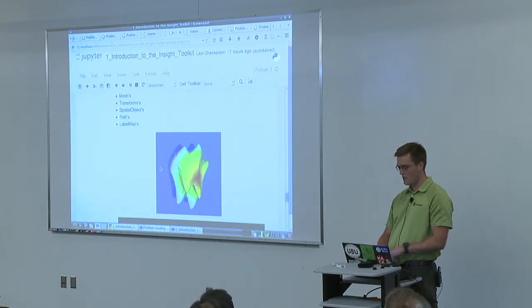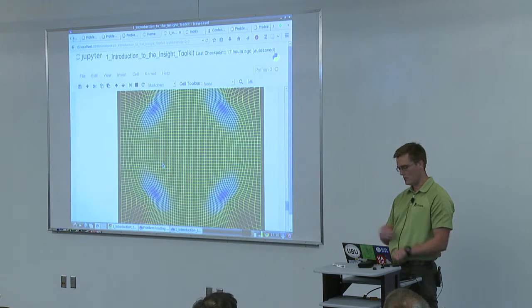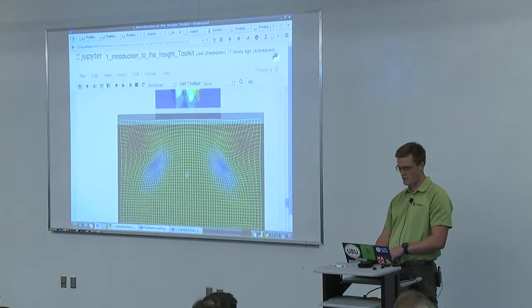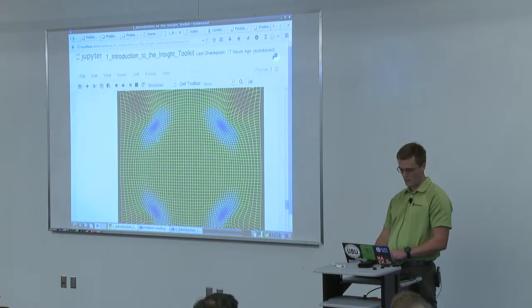But it's also extended, it has support for other things other than images too, like meshes, transformations, paths. So people who are doing analysis of dendrites from neural cells. And here's an example of a mesh, and here's an example of a visualization of a transformation, again, in space.